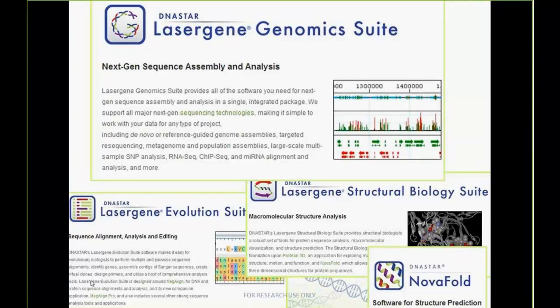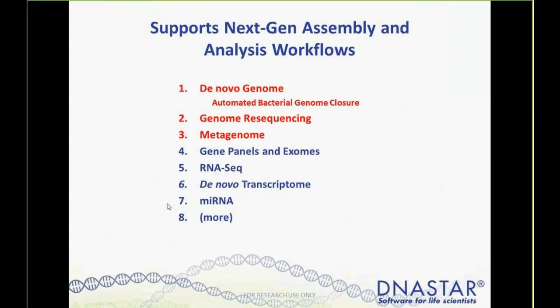And so I won't focus too much on individual applications, but just to be aware, there are multiple different applications that focus on different things. The workflows that we cover with NGS are wide-ranging, and I have a few highlighted here that we're going to cover today.